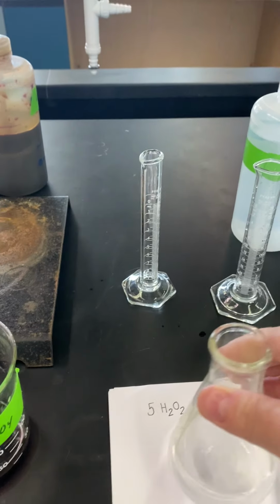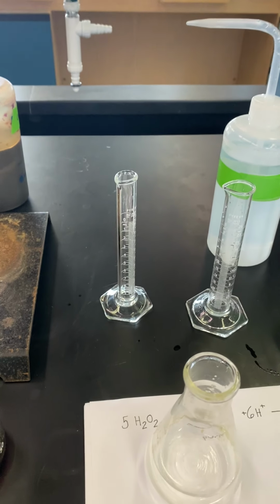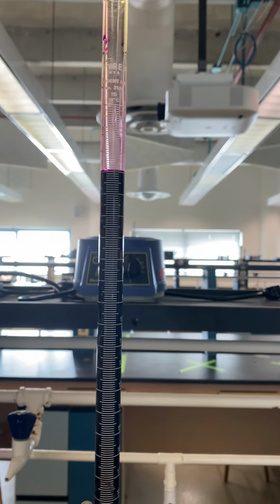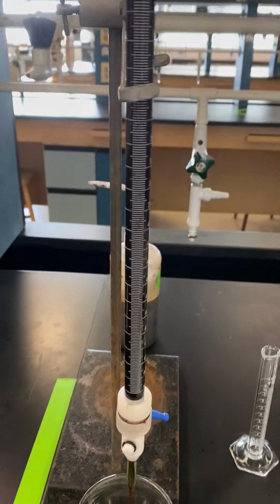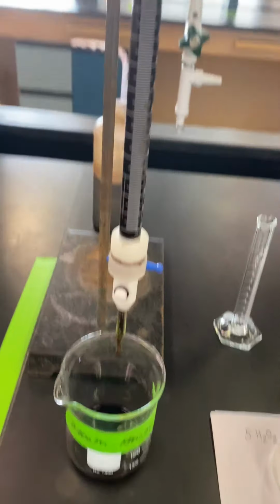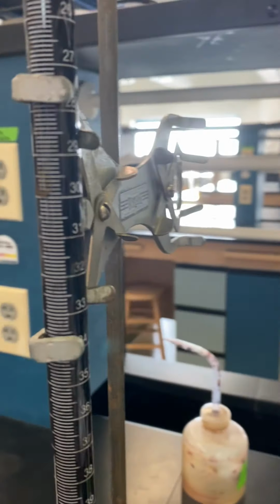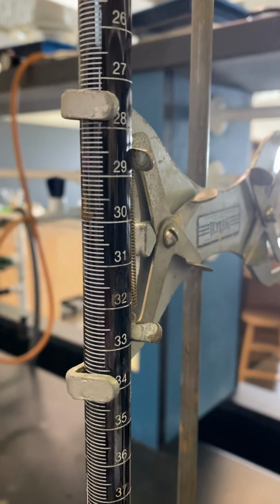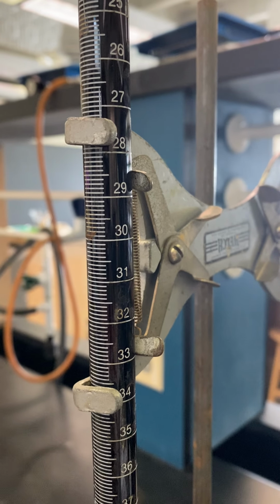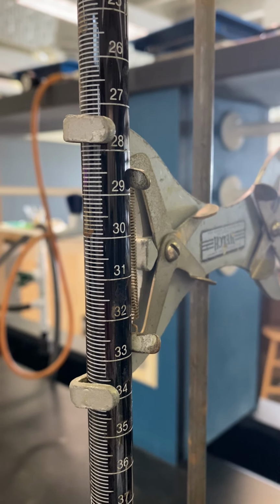We still need one more piece of data before we can start our titration though. We need to know how much potassium permanganate is starting off in our burette. Okay, so our burette, you can see, has markings every milliliter, but then also markings every 1/10 of a milliliter.